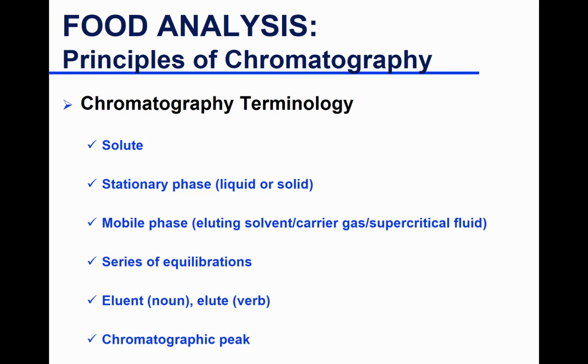But just to illustrate what I mean, and here you have time. So you will end up having a chromatogram that has time on the x-axis and the detection, either absorption or conductivity in this case. So at every time point, there will be a reading. As time goes by, the detector is going to read. When you start seeing a compound leaving the column, automatically the system will start measuring absorbance, let's say.